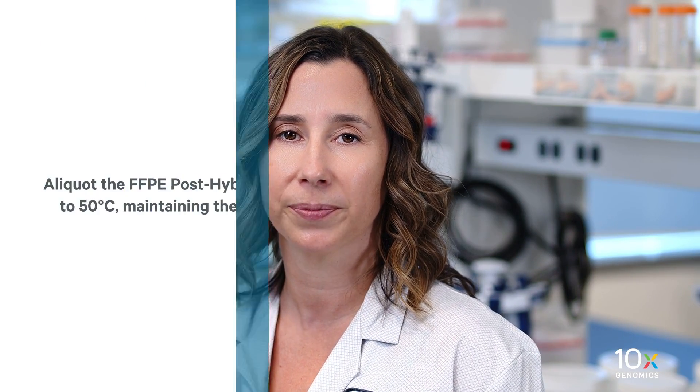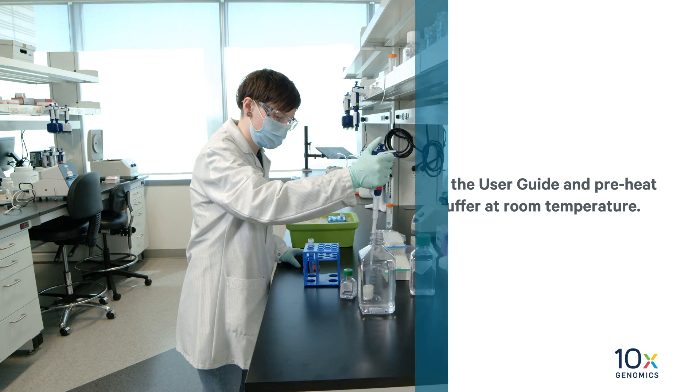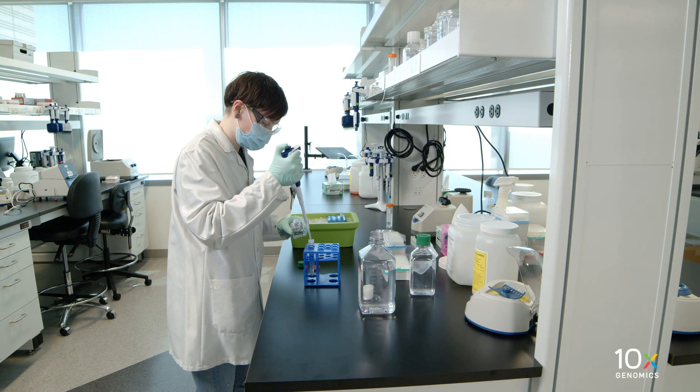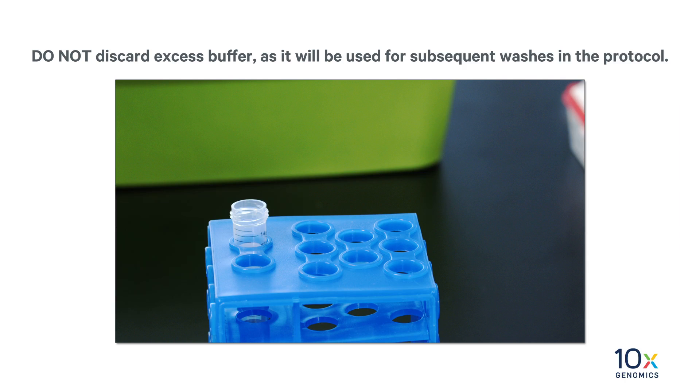First, we will perform the post hybridization wash. Aliquot the FFPE post-hype wash buffer as described in the user guide and preheat to 50 degrees Celsius, maintaining the remaining post-hype wash buffer at room temperature. Prepare 2X SSC buffer by diluting 20X SSC with water. Maintain at room temperature. Do not discard excess buffer as it will be used for subsequent washes in the protocol.